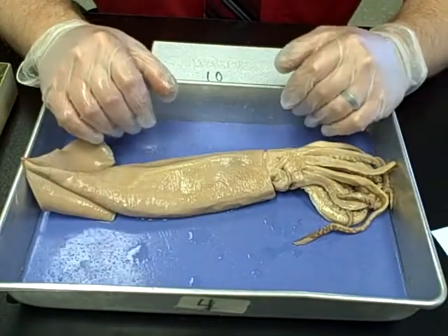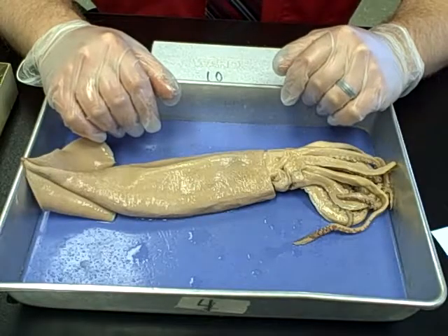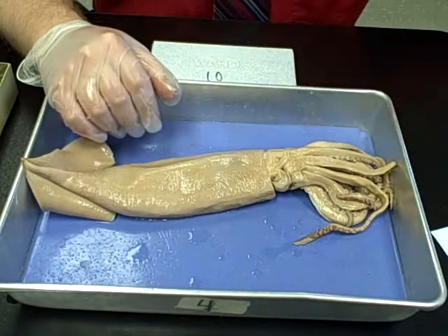Just be careful and take your time. Make sure you're taking your turn when it comes to rinsing it off. Then we'll go through some external anatomy for the squid first.